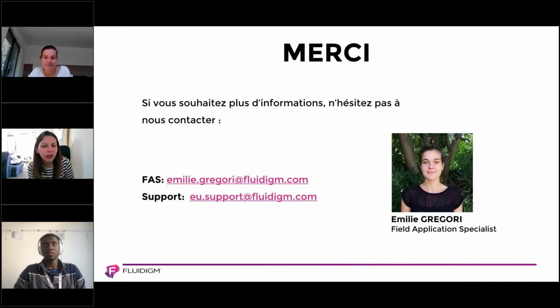If you don't know the background of my patient, how can I know if my sample is contaminated? Okay, it's a good question. I would say you just see with the core facility if they can test your sample. Maybe provide a little aliquot of your sample and ask Miguel and Sena to look at it. You can do a really low concentration of your sample and see if there is any contamination before your staining. If there is a contamination, you will not do your staining on these samples.